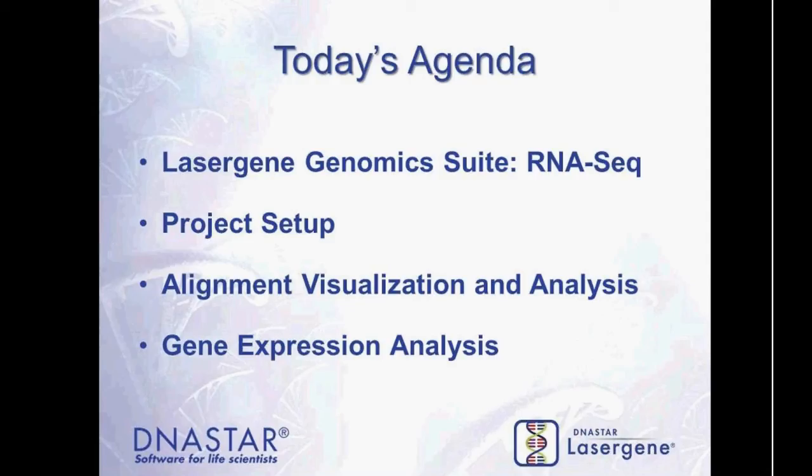So today's agenda is to go over the RNA-Seq workflow. I'll go into the actual software, walk you through the project setup, then I will go into the alignment, visualization, and analysis tools, and then I will go into our gene expression analysis tools. And as Katie mentioned, if you have any questions, you can just chat her, and she'll interrupt me, and I'll be able to answer them for you. And with that, I will jump right into the software.